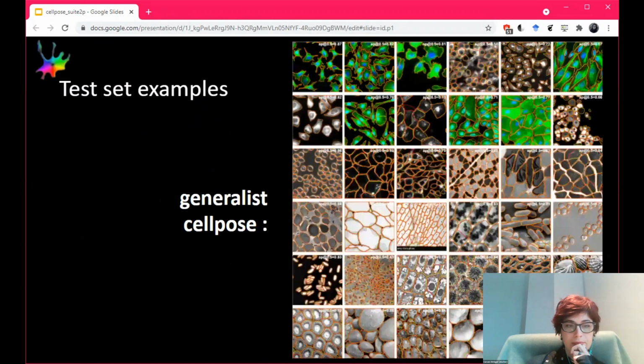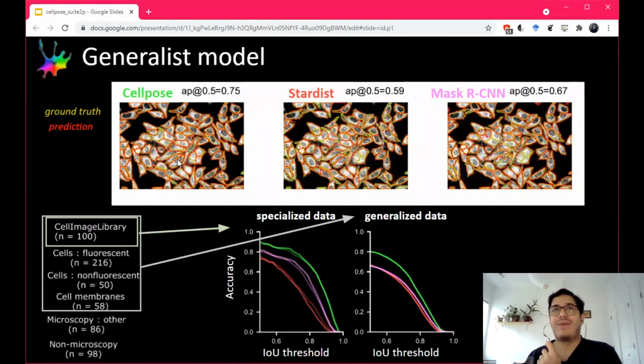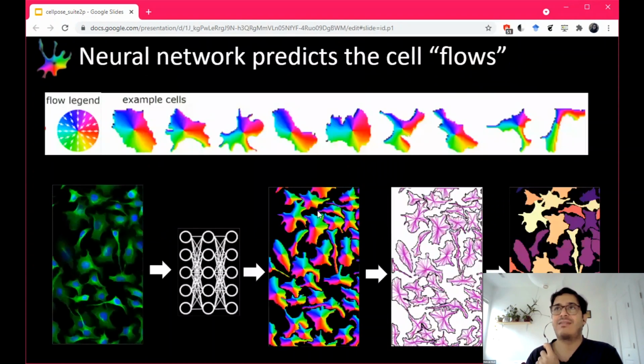Carsen, I have a quick question. In the plots you showed here, when two cells overlapped, one of the cells was on top, and the flow diagram for one of the cells was on top, and the other one was cut in two. But in truth, you probably have two complete cells, like you have layers and two complete flow diagrams when you're actually training.